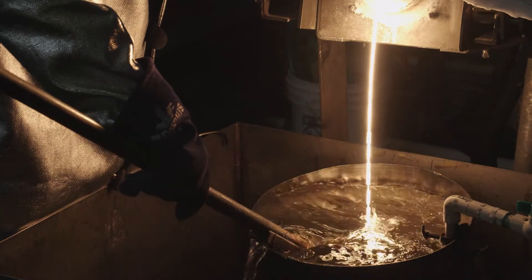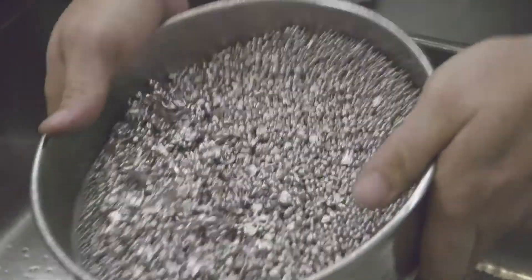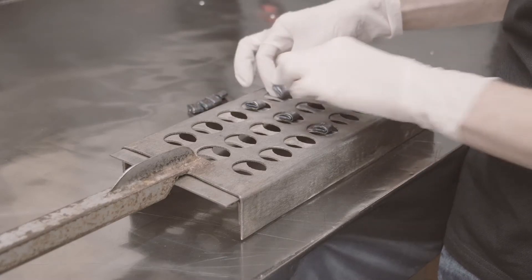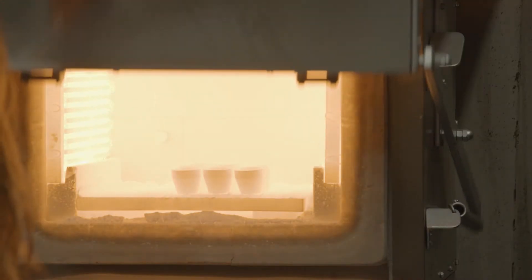As metal sheet, rod, or grain is made throughout the day, samples are brought to the lab for testing. To test for gold, the sample is placed in a lead pocket before it heads to the oven.